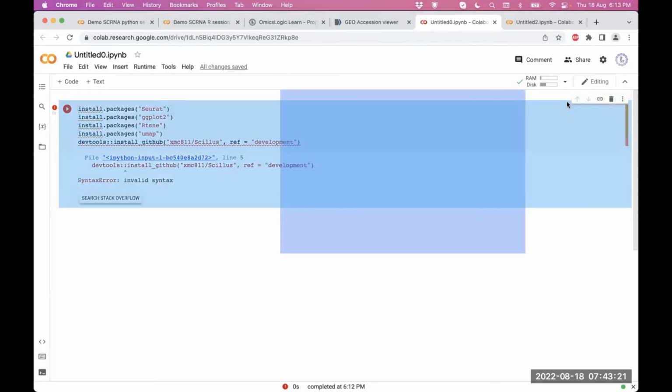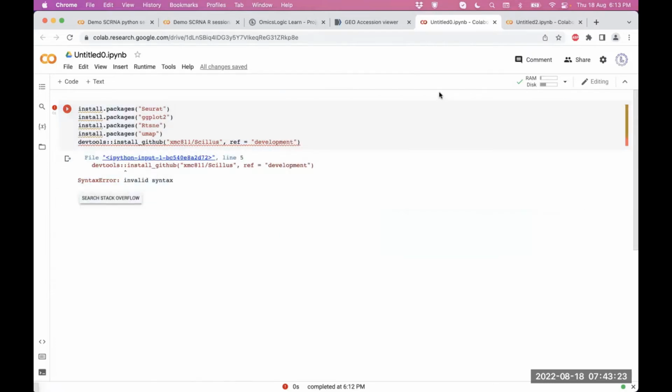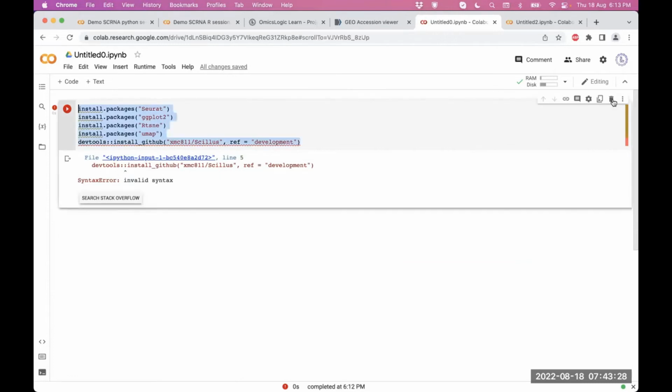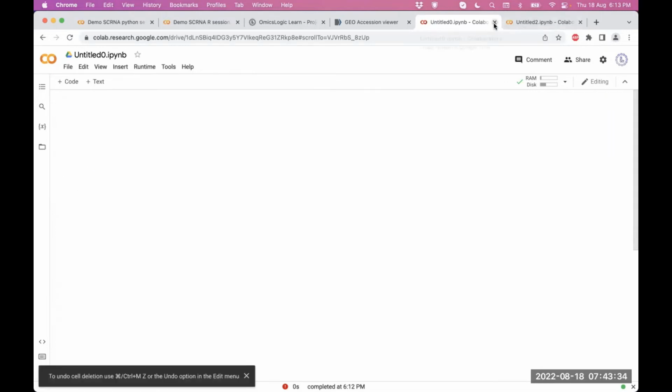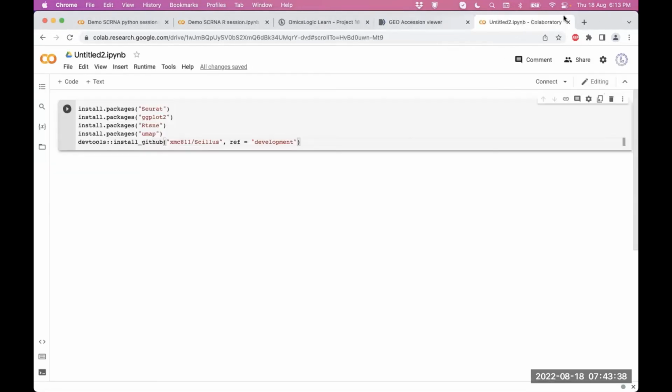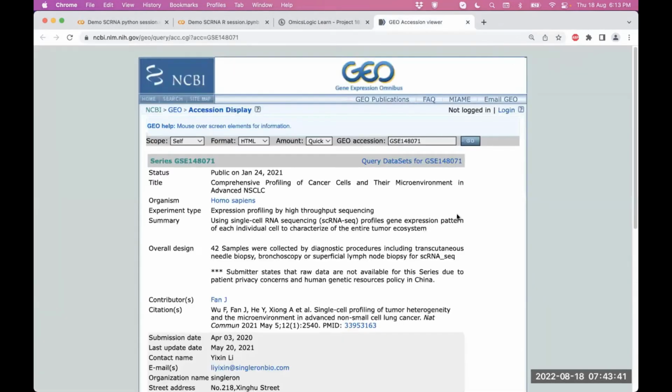So everybody, it is working. So that is the case. Let me clean up some of these things. So we let this run, and then we will come back to this later. Leave that, that's okay. And I also don't want this. Okay, so we'll come back to this in a while.